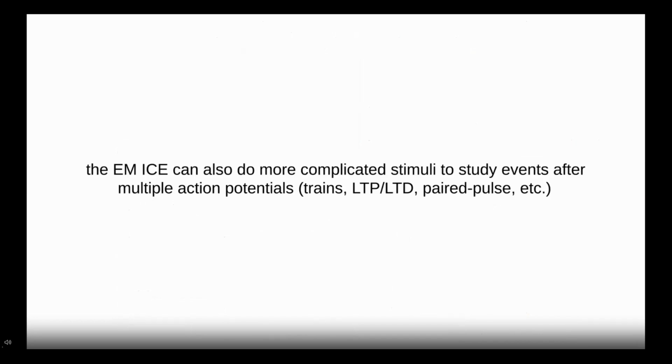So that's the end of the data. What I will say is that, especially when we're talking about plasticity, many of you neuroscientists here might be saying, well, everything was just done with single action potentials. And that's true. We always tend to start with that simplest case of just stimulating once and then seeing what happens. But really, this system is amenable to any kind of electrophysiology experiment you could possibly design: any kind of train stimulation, LTP, LTD, any kind of weird protocol of stimulation you could possibly imagine, with whatever amount of action potentials, with whatever time point.